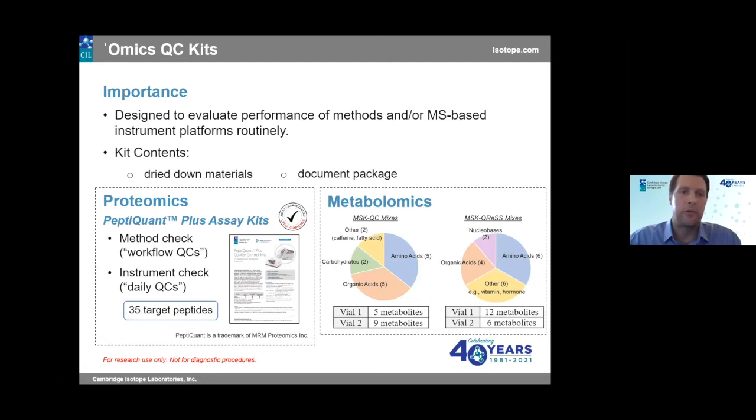First, quality control. Quality control is an integral aspect of method design. In theory, QC samples should be inserted intermittently throughout batch run sequences to help evaluate performance of methods and/or MS-based instrument platforms. And this should be performed routinely.